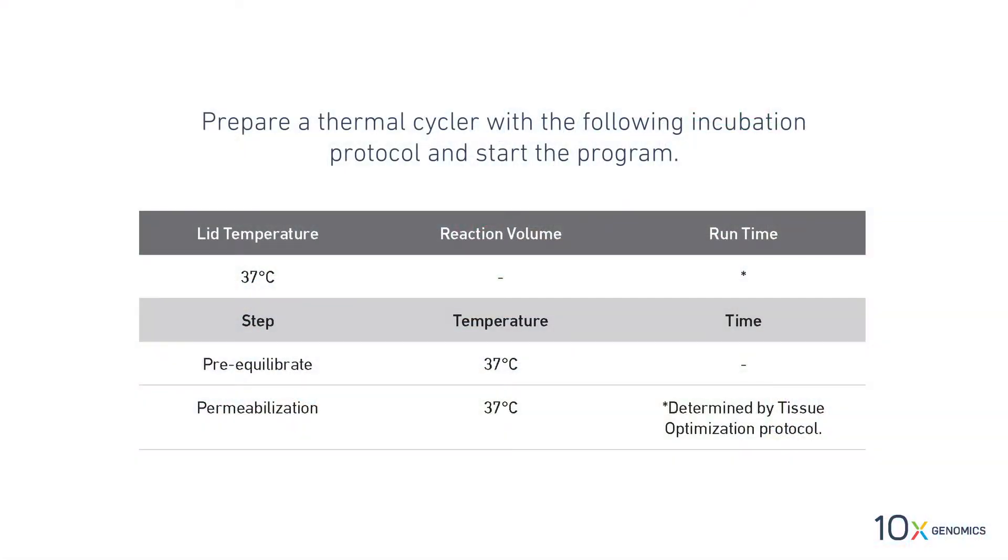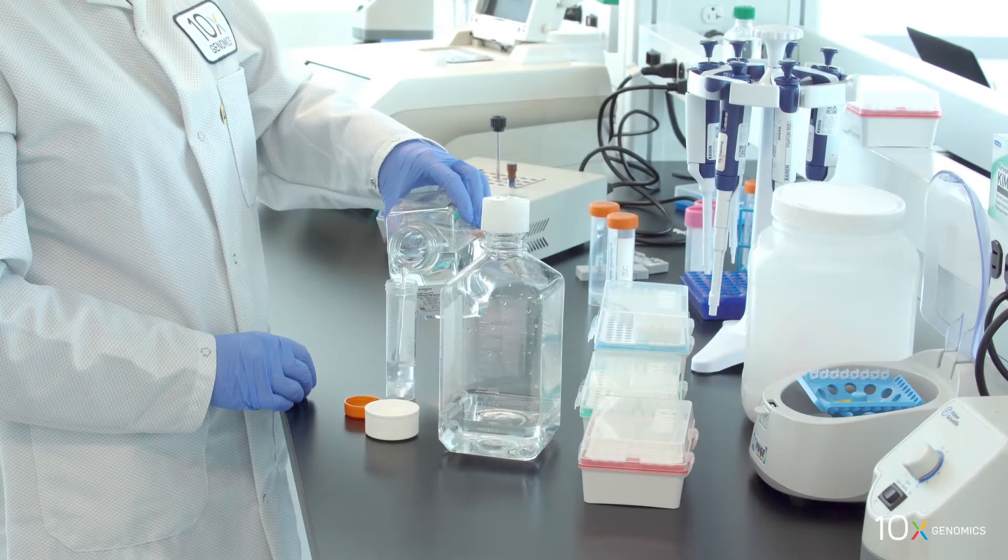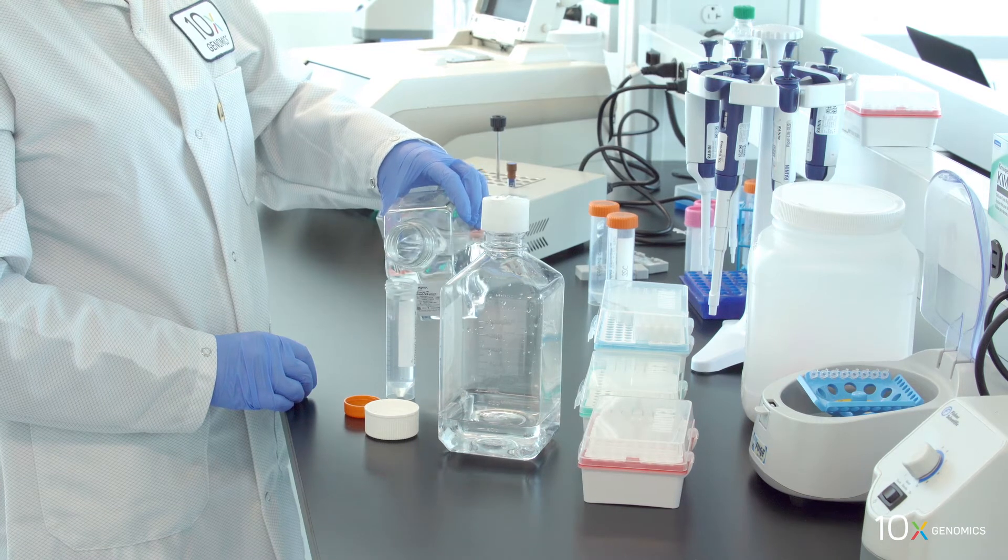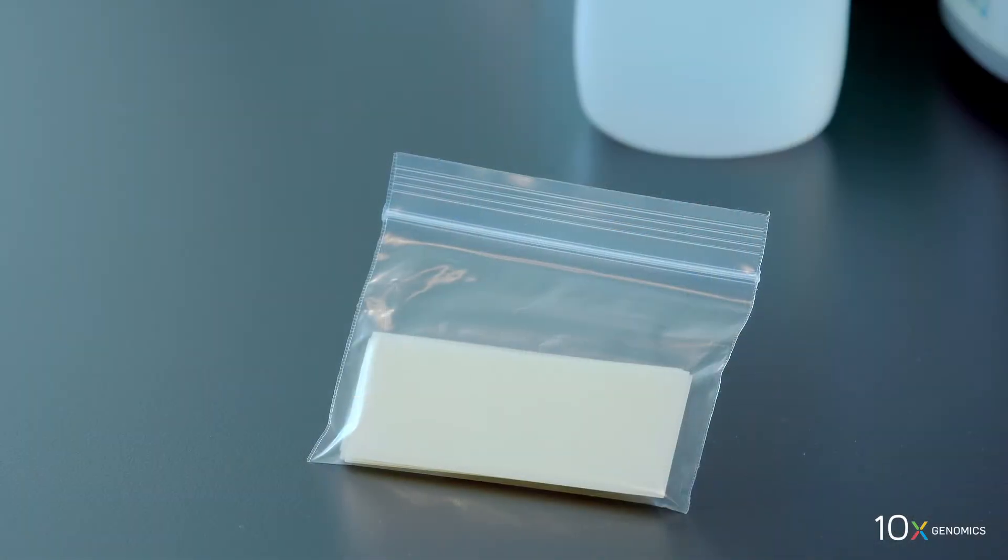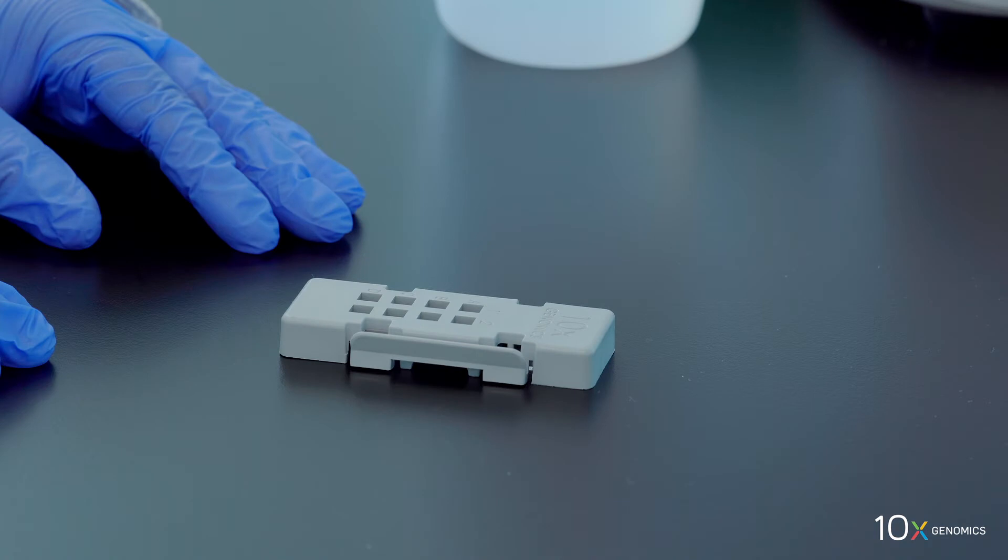Place a thermocycler adapter in the thermal cycler. Prepare a thermal cycler with the following incubation protocol and start the program. We have previously prepared 0.1x SSC and slide seals. Finally, we have the assembled slide in the slide cassette flat on the bench. We are ready to permeabilize the tissue.